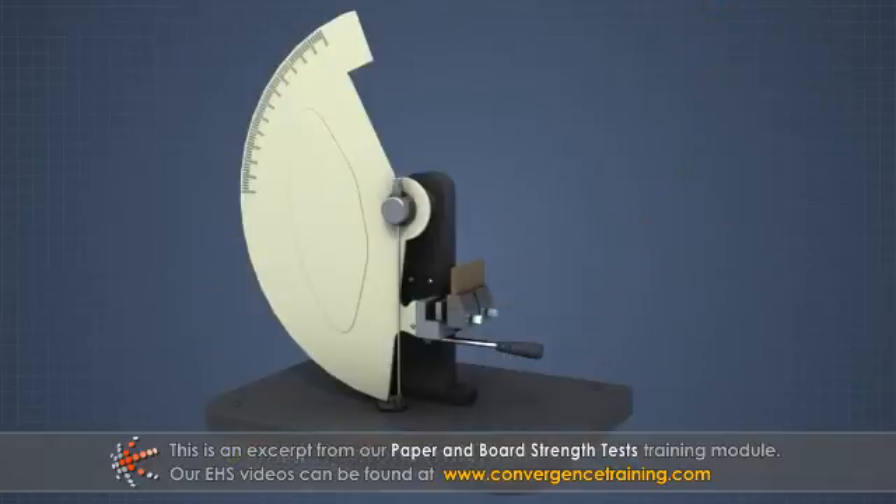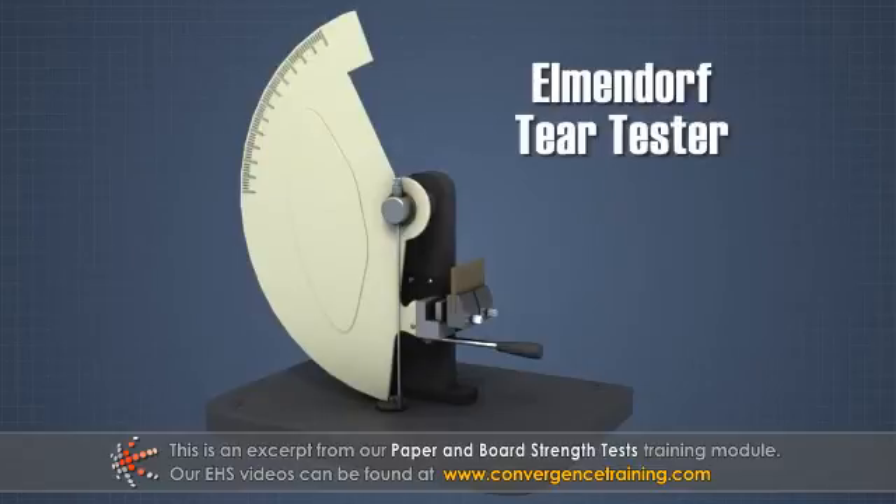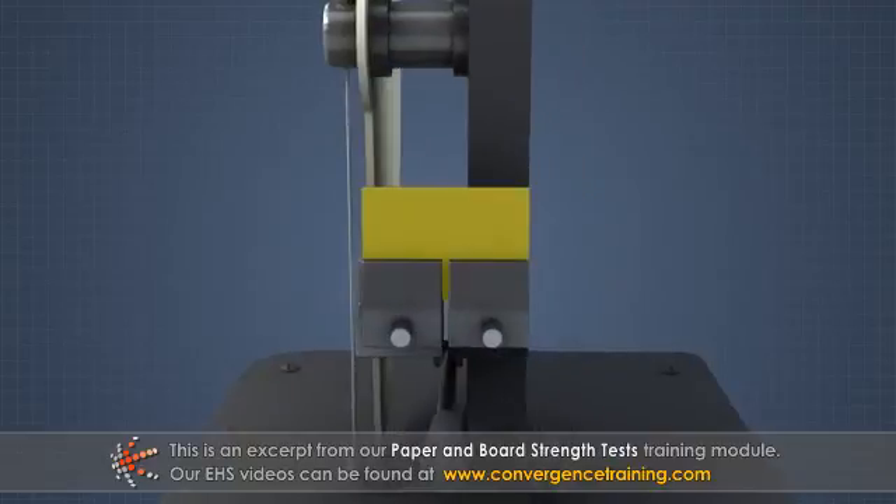There are several available test methods, but the most common uses the Elmendorf tear tester. With this tester, a sample strip is clamped in two places, and a slit is cut between them.